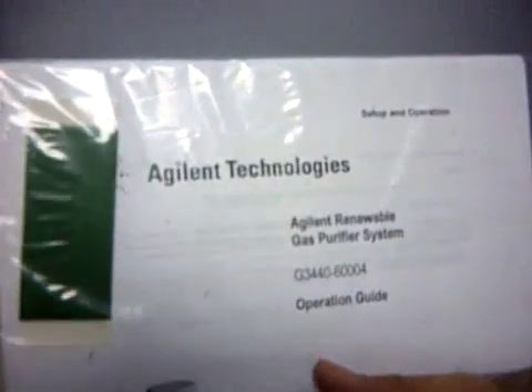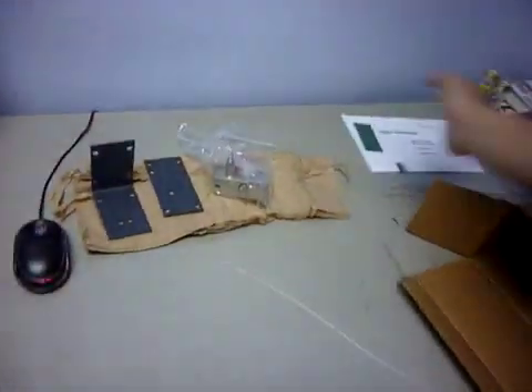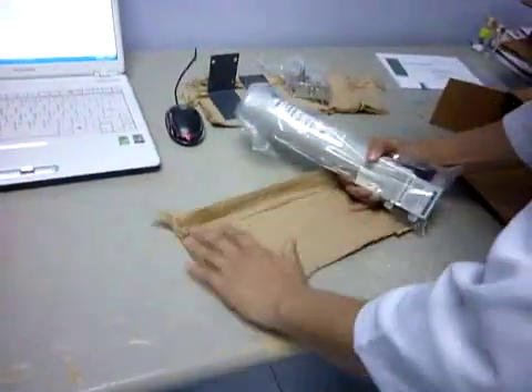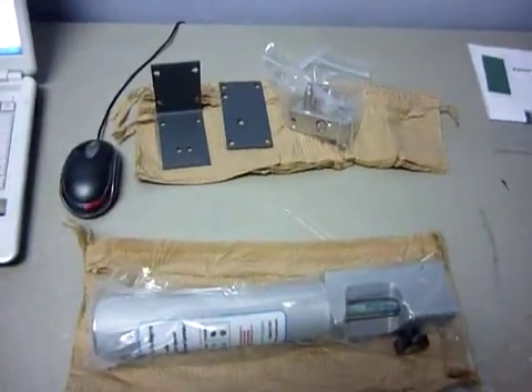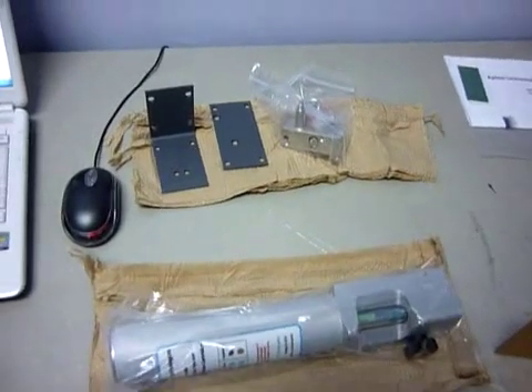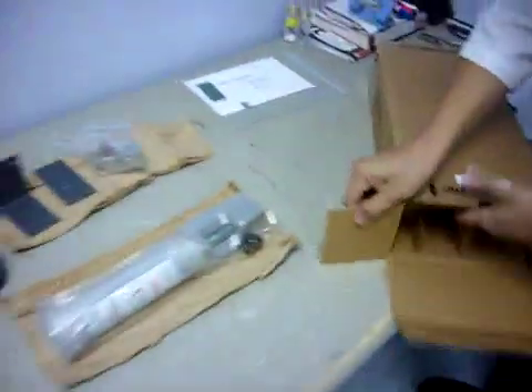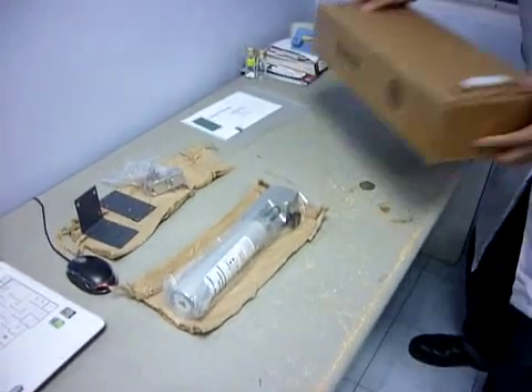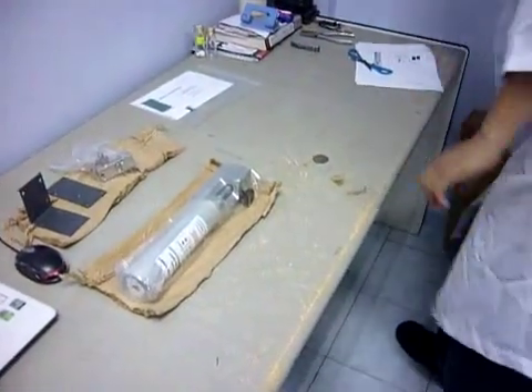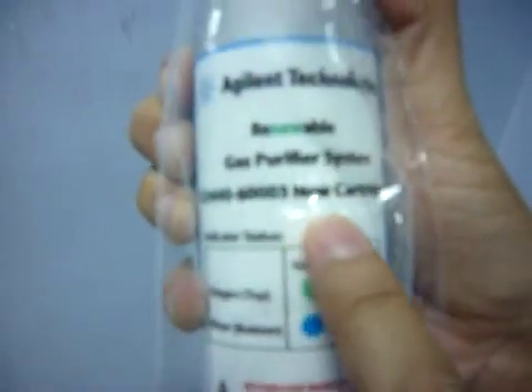This is the operation guide. Just put it here, and then I keep the box empty now. So this is where things are to be placed. This is the gas purifier — the renewable gas purifier system.